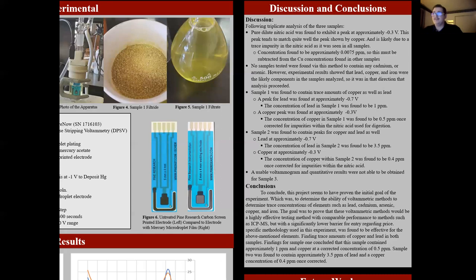Sample one was found to contain trace amounts of copper as well as lead. A peak for lead was found at approximately negative 0.7 volts. The concentration of lead in sample one was found to be approximately 1 ppm. A copper peak was found at approximately negative 0.3 volts. The concentration of copper in sample one was found to be about 0.5 ppm, once corrected for any impurities within the nitric acid used for digestion.